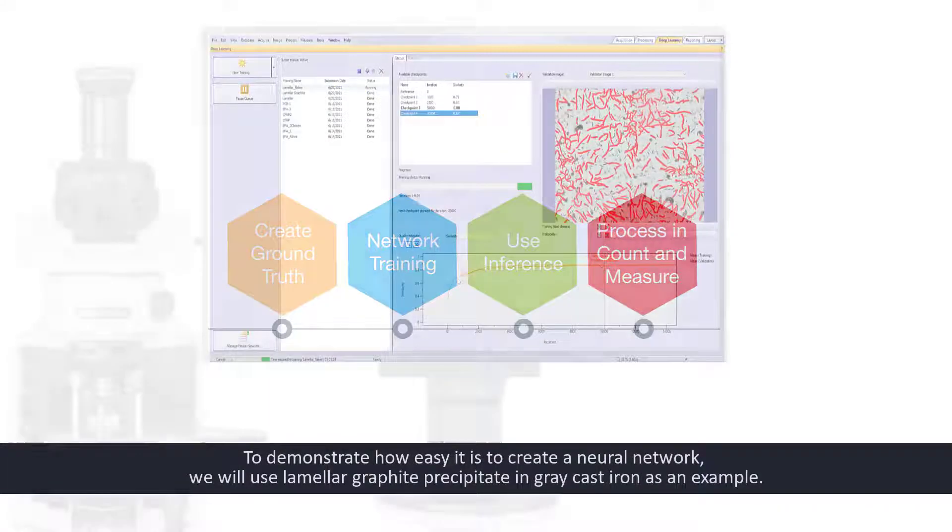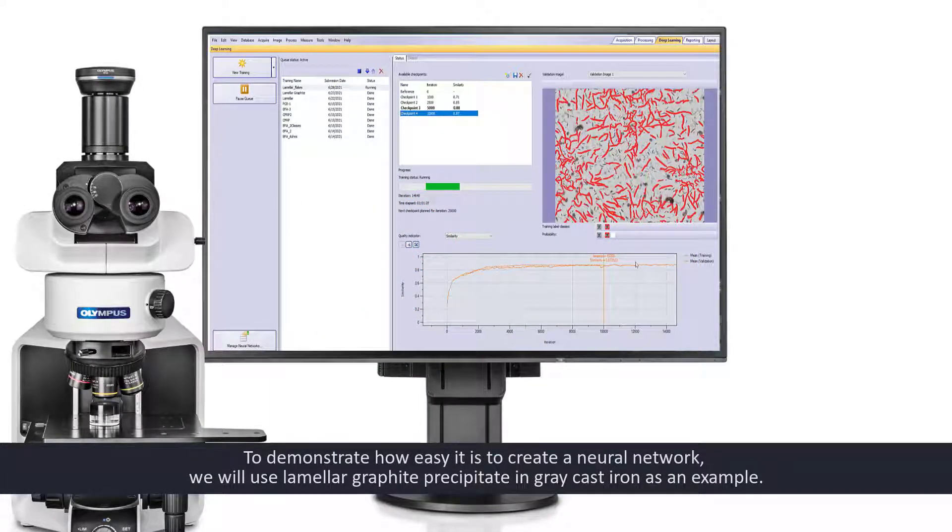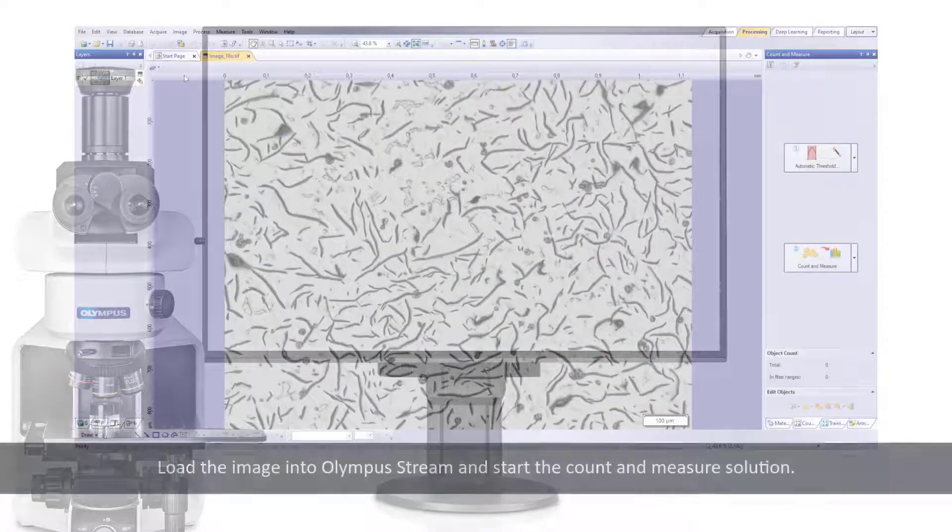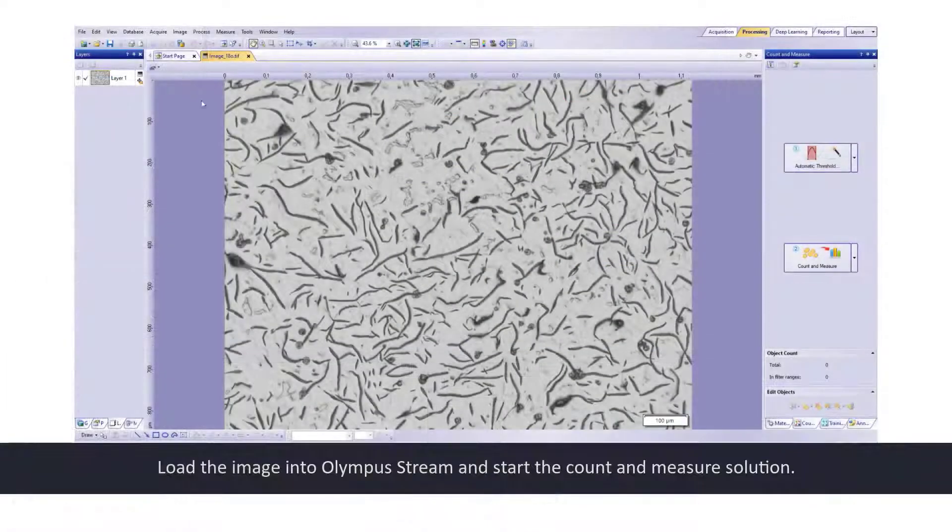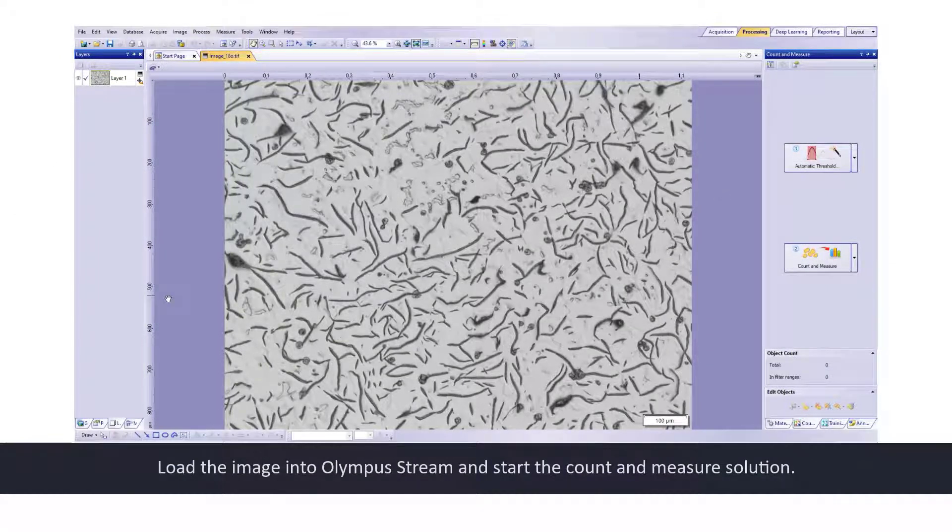To demonstrate how easy it is to create a neural network, we will use a lamellar graphite precipitate in gray cast iron as an example. Load the image into Olympus Stream software and start the count and measure solution.